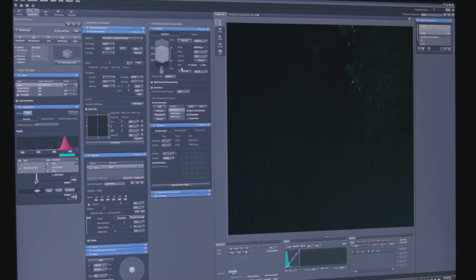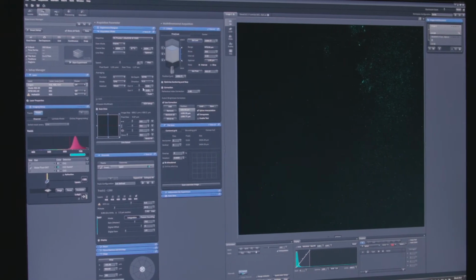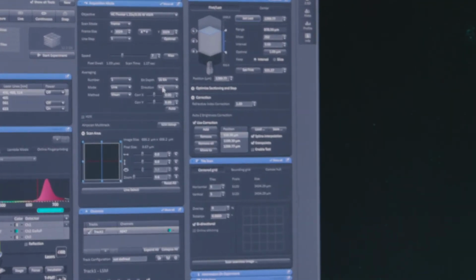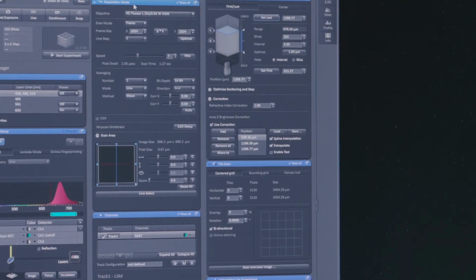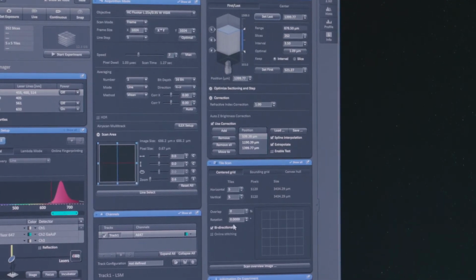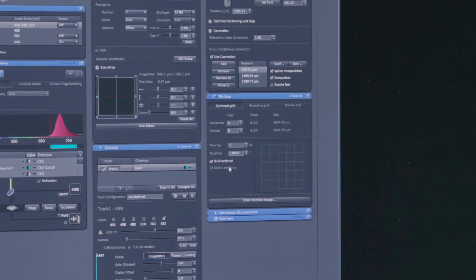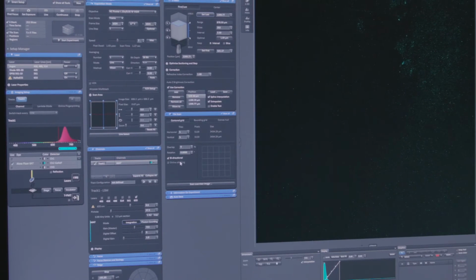Yeah. Very nice. And of course, another trick can be that if your confocal allows it, you can set everything as bidirectional scanning, like here in the acquisition mode, or even here in the tiling scan, you can set up the bidirectional. So in this way, it will scan from both sides, so you can save time, half of the time. Okay, that will be faster.